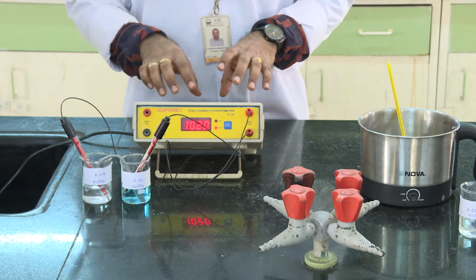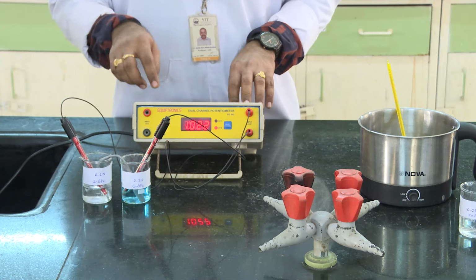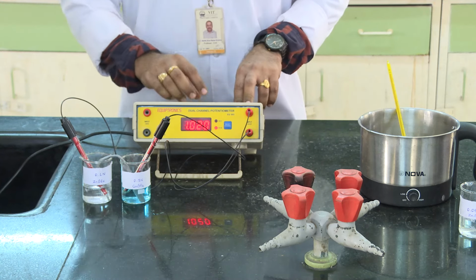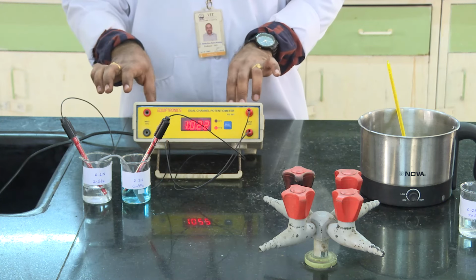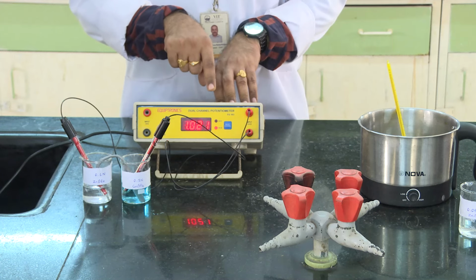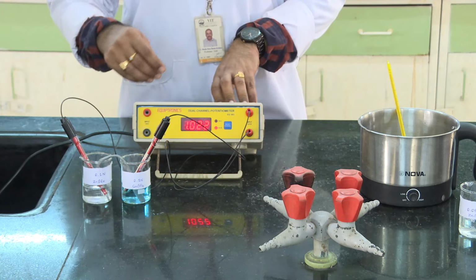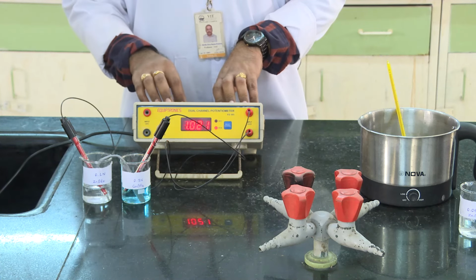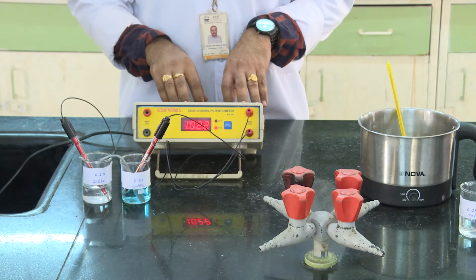Actually, the standard potential should be around plus 1.1 volts. Now the value is close to that, plus 1.021, at room temperature. The Daniell cell shows an EMF value of plus 1.021, and now we are doing other experiments using different concentrations of zinc and copper, such as 0.05 copper, as shown in the final result.